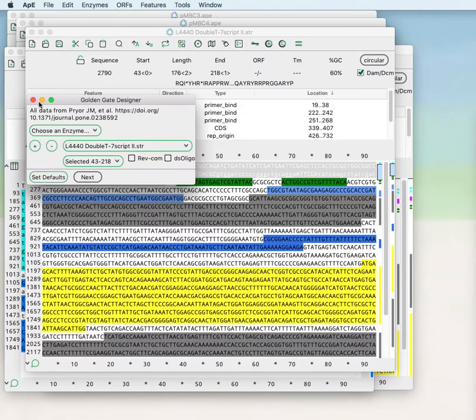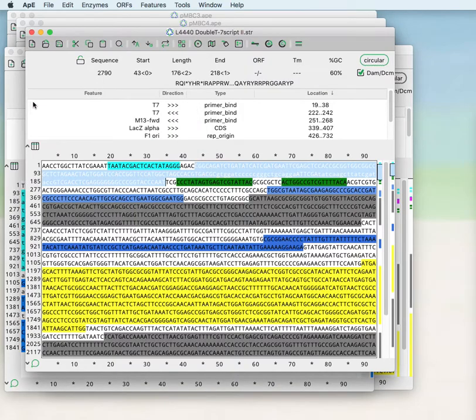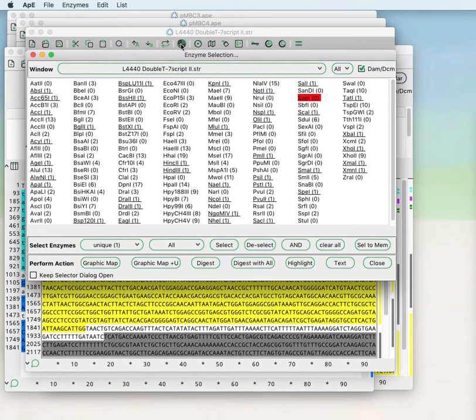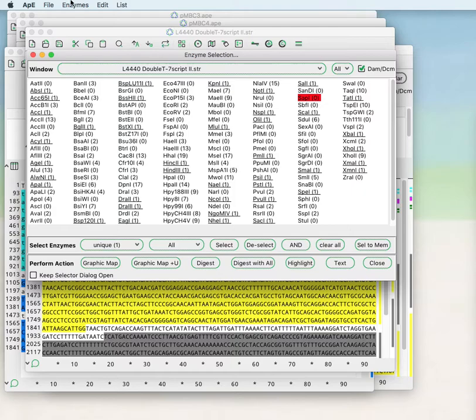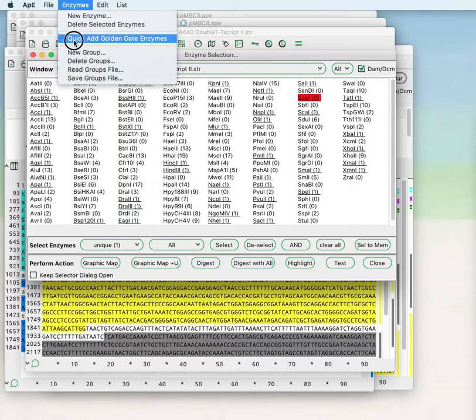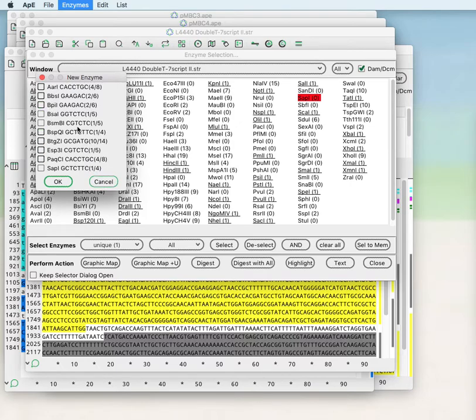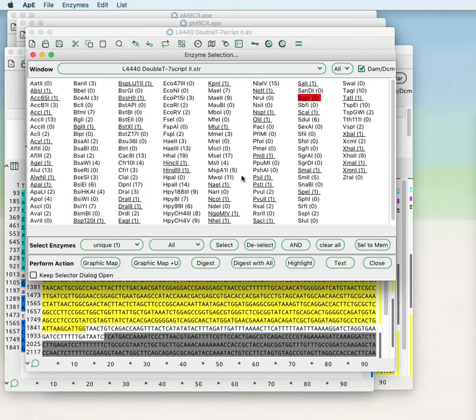If you have no enzymes available to the tool, go into the enzyme selection tool, go to the main menu item enzymes, quick add Golden Gate enzymes and choose any of the enzymes that you would like to use from here. When you check these boxes and press OK they'll be added to your present enzyme set.